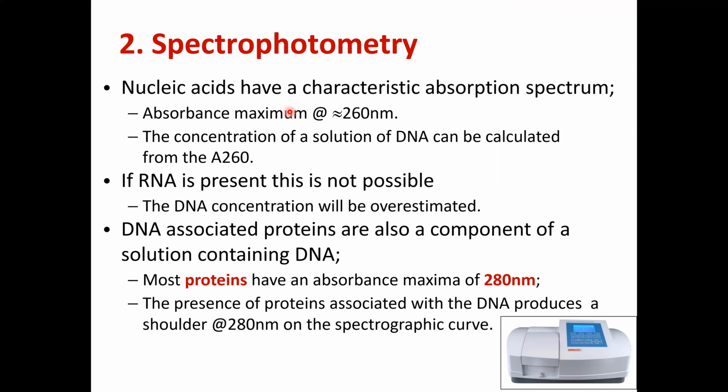So with these spectrophotometry applications, such as nucleic acid quantification or isolation, there are different absorption spectra. For nucleic acid, the absorbance maximum is at 260 nm.